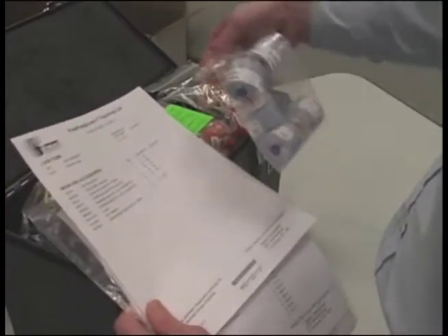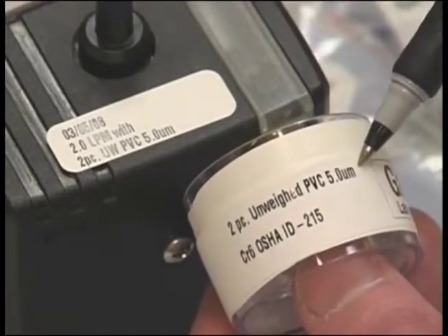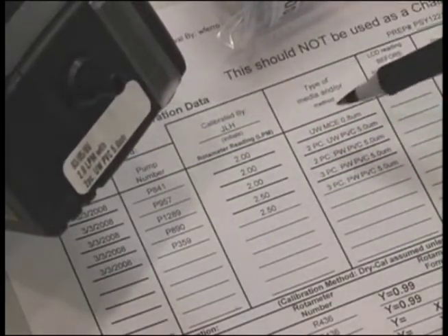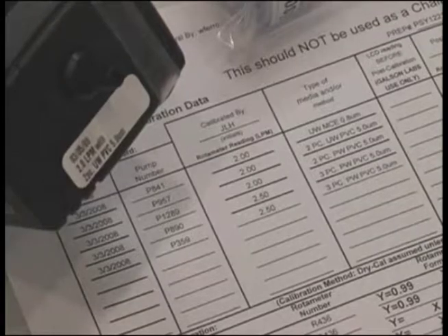Confirm you have all media and materials requested for your sampling event using the packing list provided. Make sure you keep pumps and their corresponding media together and know which media is used for each method. This can be done by matching the pump calibration sheet information with the label on the pumps to see what pumps are to be used with what media. The labels on the pumps should match the information on the pump calibration sheets.